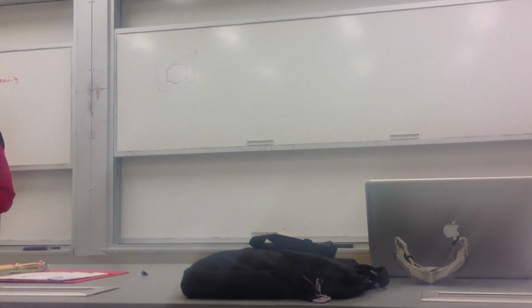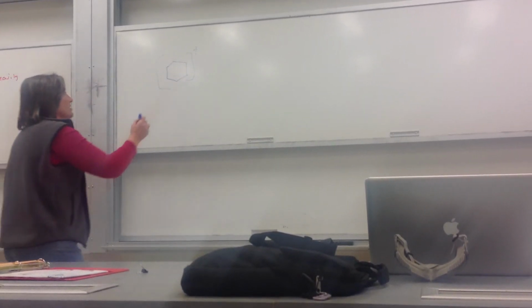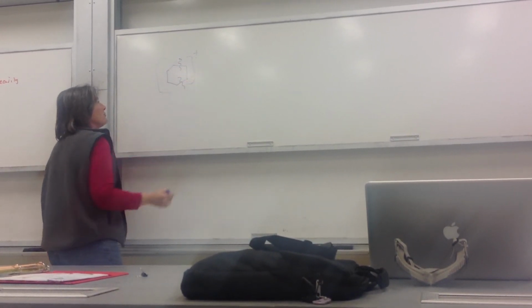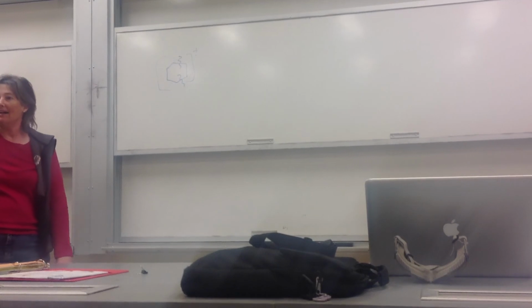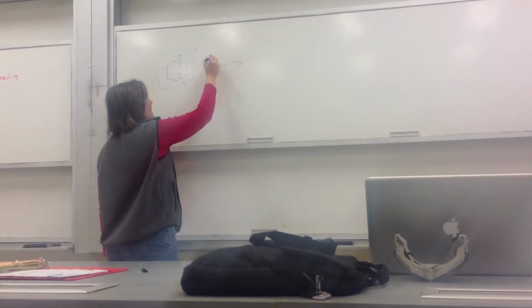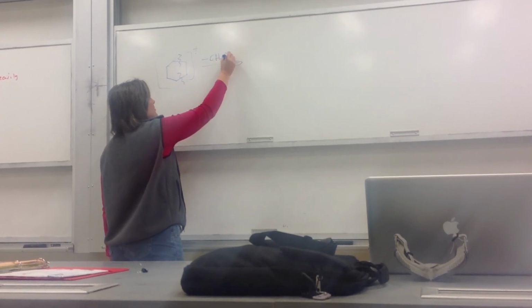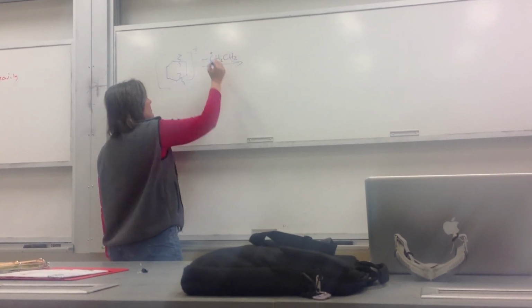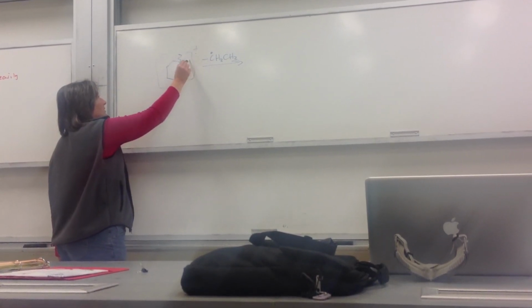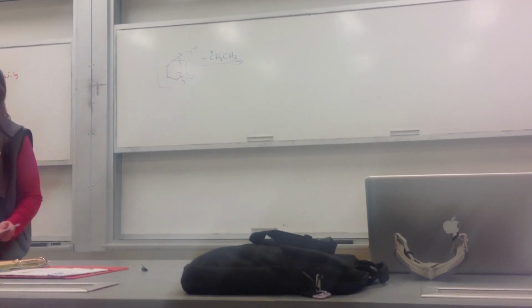We cracked off the 3 carbon piece. Now what is going to happen is we are going to break out right here and right here. It breaks out 2 connected carbons. And what we have is minus CH2, CH2 dot. So that is this portion right here. That's the C2H4 that you were seeing.